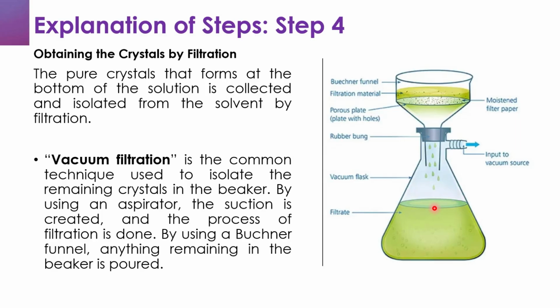So the next step is obtaining the crystals by filtration. The pure crystals that are formed at the bottom of the solution are collected and isolated from the solvent by filtration. And this can be done either by a vacuum filtration or a gravity filtration.